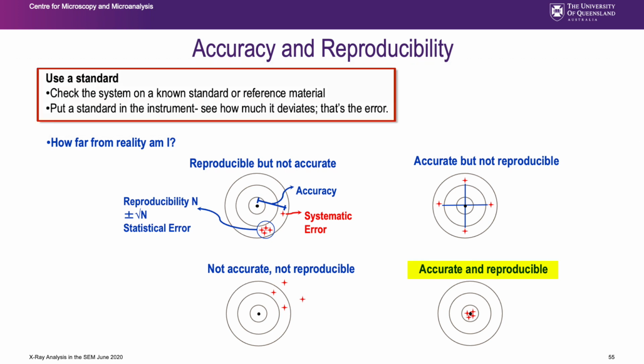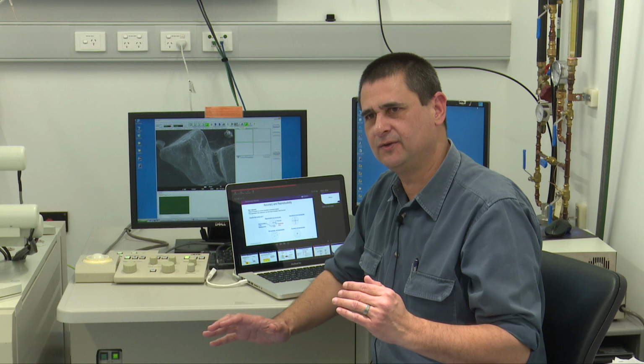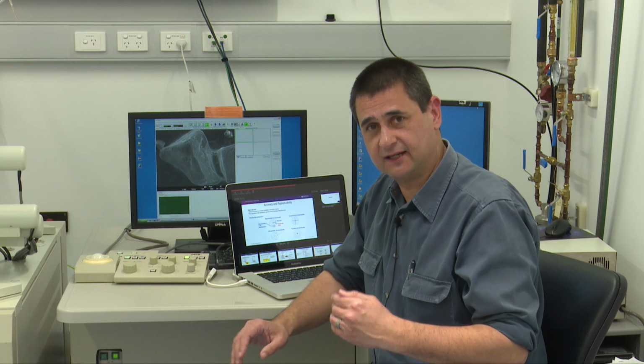Good quality microanalysis is verifying the system works, and it's having a vast selection of reference materials and standards behind you. You can spend a significant amount of time not looking at your specimen, rather calibrating on one set of reference materials and checking your calibration on another set of reference materials before finally looking at your material. Most people just do standardless quant on EDS and push the button, and that's okay, but I want you to know what's happening in the background for you and how much effort is in taking it to the next level.